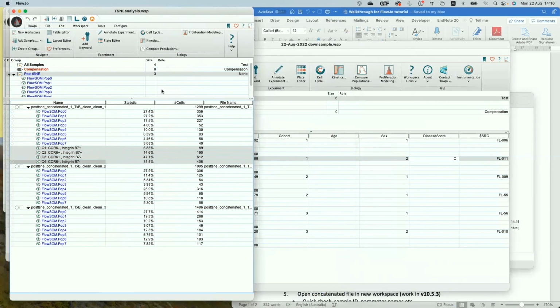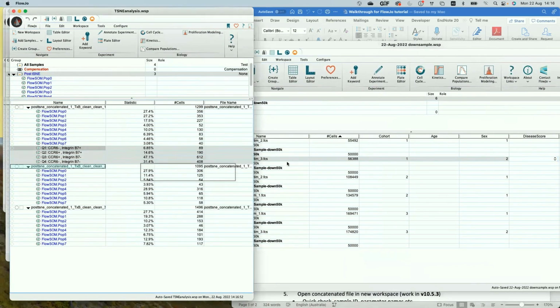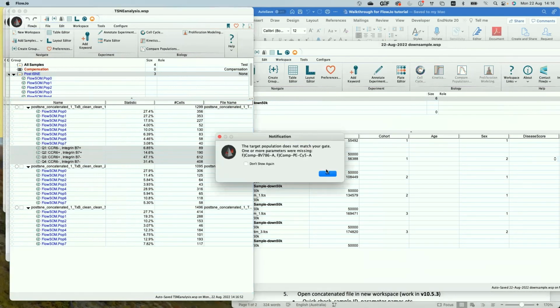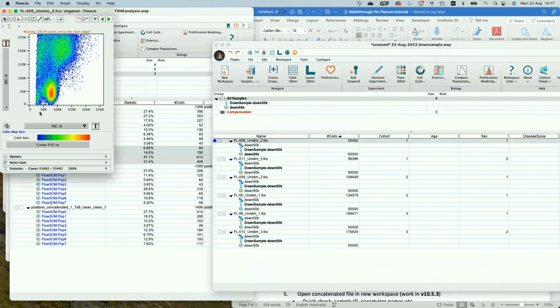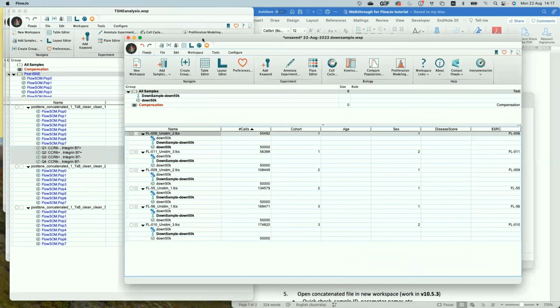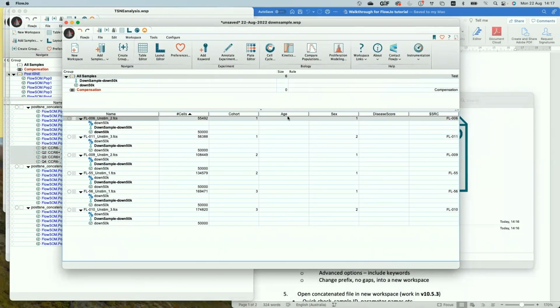The fun thing is you can use these FlowSOM populations to do almost like a purity check. If you think that population 6 is of interest, you can start playing around with what is my minimum gating strategy to capture like 80–90% of that population of interest. This was the gate I had of interest. I can now drag and drop that back over here. I've defined what that gate's going to be. I can come into my original samples and apply that gate essentially, and then I can export it.